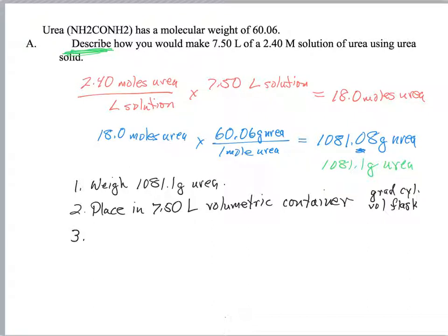Three, we would dissolve our solid in water, since we wanted to make an aqueous solution.